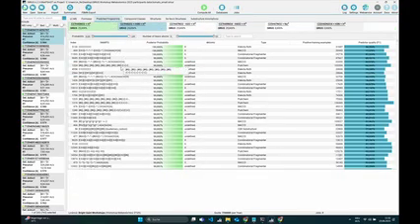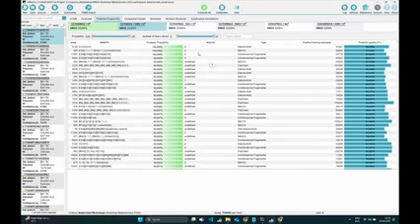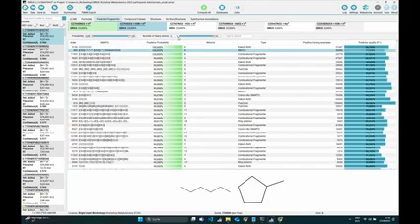So right now we haven't done any database search. So now we just predicted the fingerprint based on the MS2 spectrum and the fragmentation tree. And now we find all the substructures which our method thinks that the structure of this feature has. There are a lot of substructures and molecular properties in general. So Markus explained a little bit what the fingerprint consists of, but some of them are quite boring. So what we can do, we can filter this list a little bit.